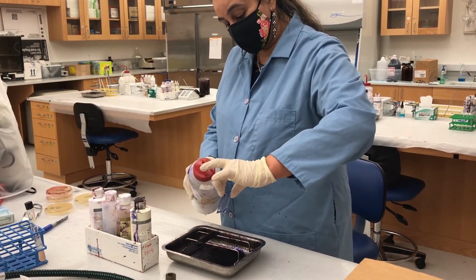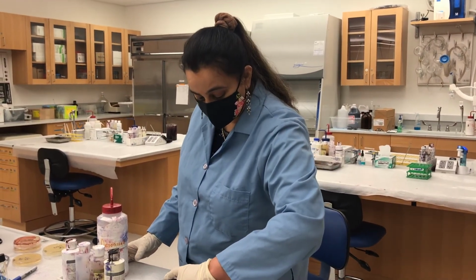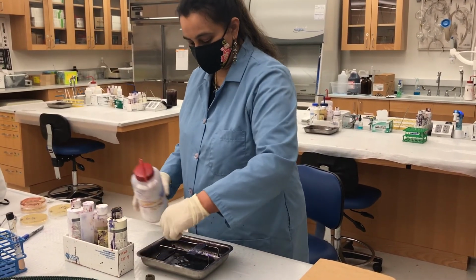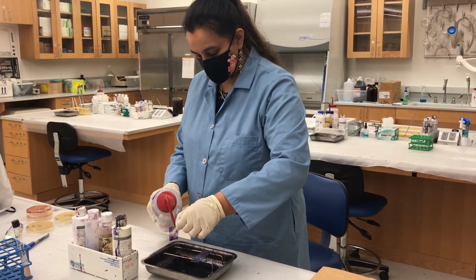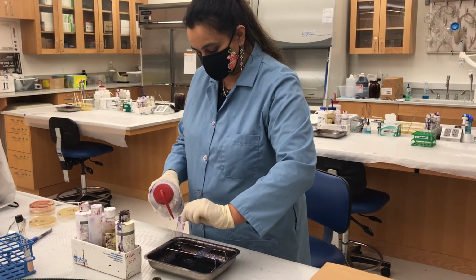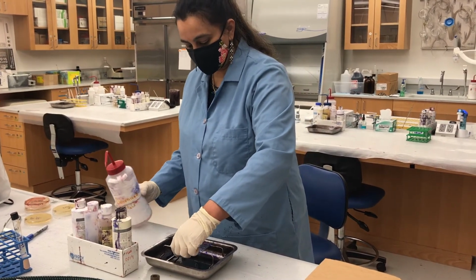And as I always said, you have to remember which side you have the cells on. If you forget the side you have the cells, that will be a problem. So I'm washing both my smears, front and back, with distilled water. And that is the very first step of the gram staining.